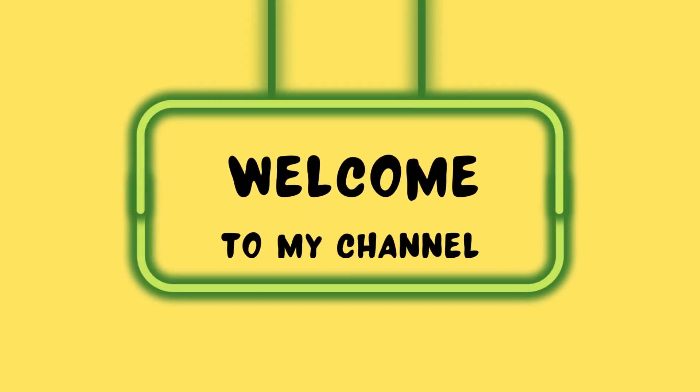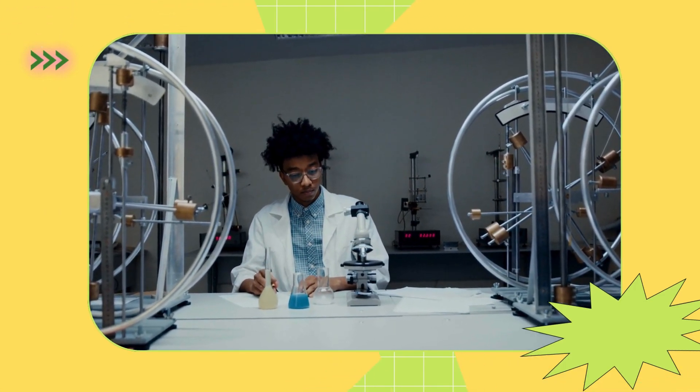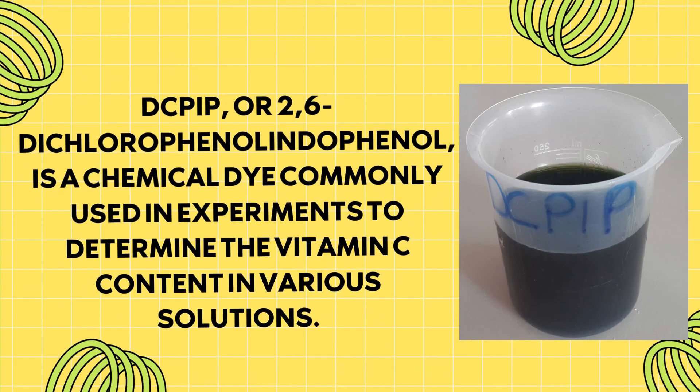Hello everyone, welcome to my YouTube channel. Today, we're diving into a fascinating experiment on testing the levels of vitamin C using DCPIP.